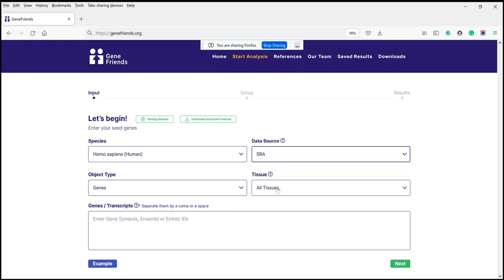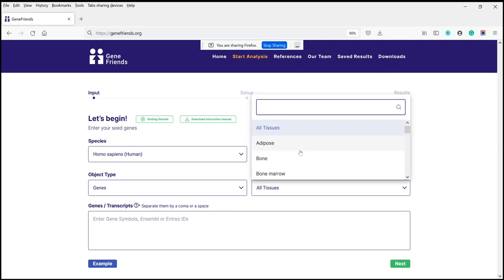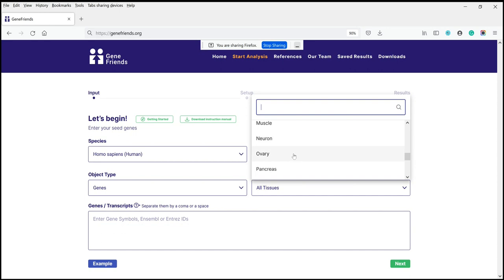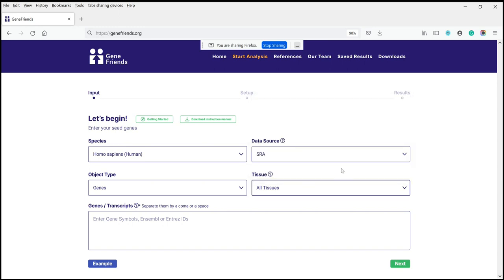For humans and mice, there's data for different tissues. So if you're interested in specific types of tissues and co-expression, those are available. It's important to point out that different tissues will have different coverages and different sample sizes. But if you're interested in a particular tissue, this is how you select it.